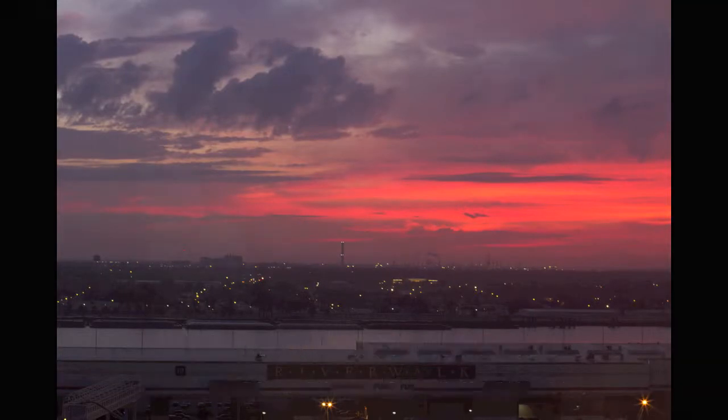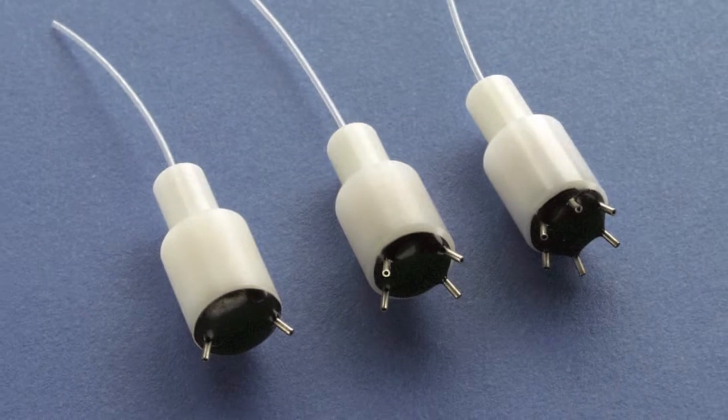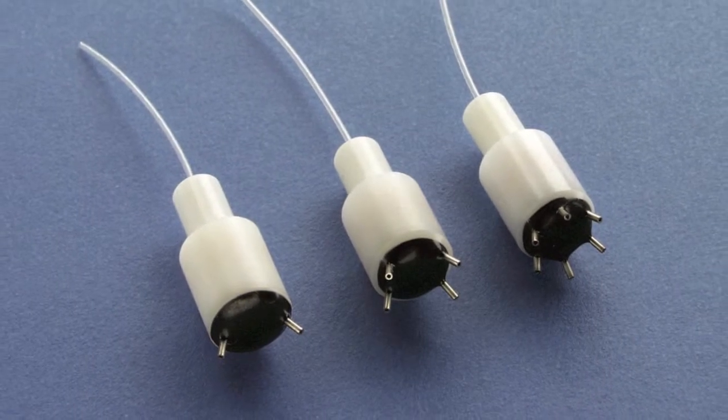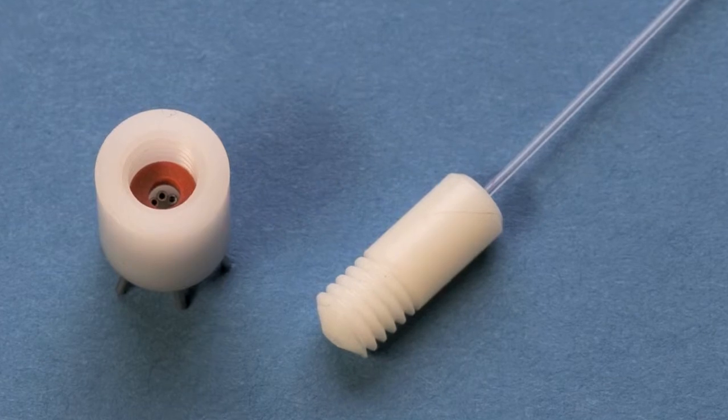Today, we're going to demonstrate how to replace the PE10 tubing used on the output side of the Warner Instruments MM series manifolds.